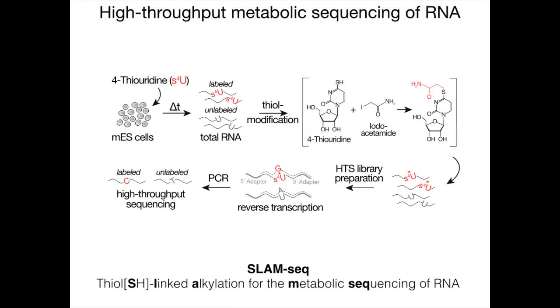Now, having spent this detour on the library preparation protocol, I would like to go into some sanity checks that we highly recommend implementing before starting a SLAMseq experiment, to be sure that one is working under unperturbed conditions and in an effective way.